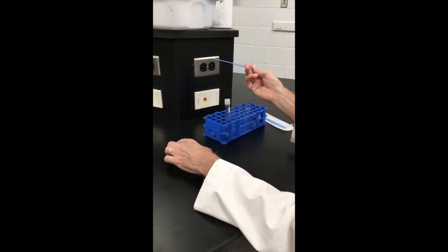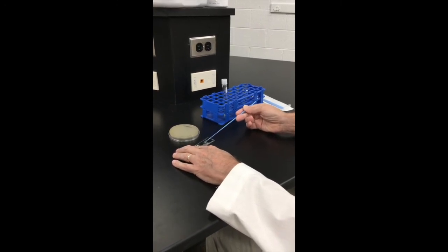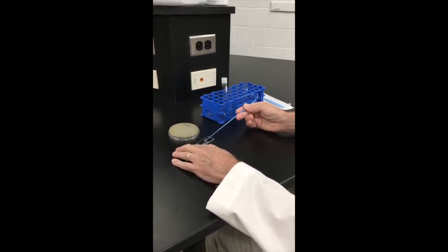By using aseptic technique, using sterile equipment and minimizing exposure of culture media, it should be possible to work with cultures without contamination.